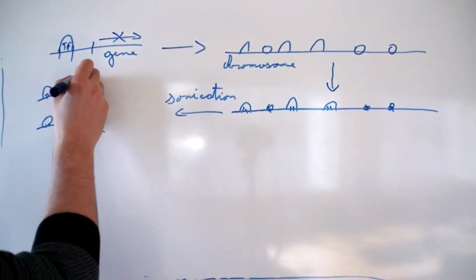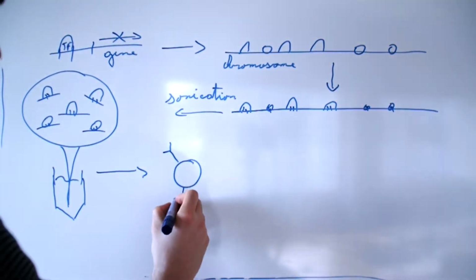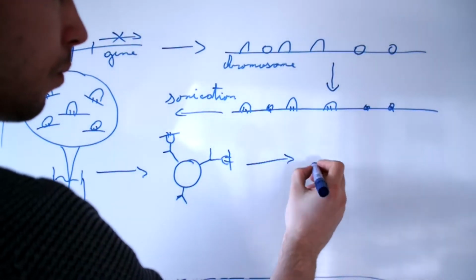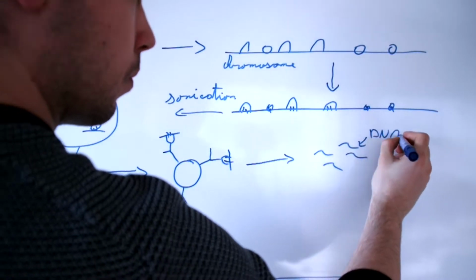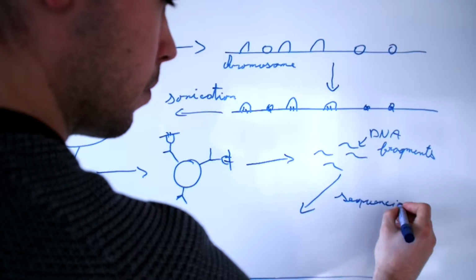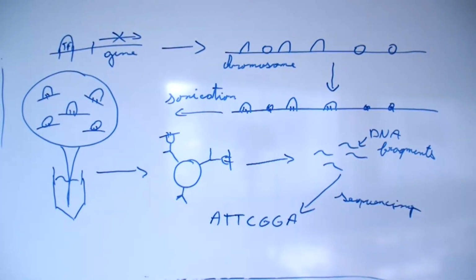Once the protein-DNA complex is floating free in the tube, we can add little beads with a specific antibody attached to it. The antibody is specific to the transcription factor and binds to it. We can then extract the beads, reverse the cross-linking, and get our fragments of DNA to feed them into the sequencer.